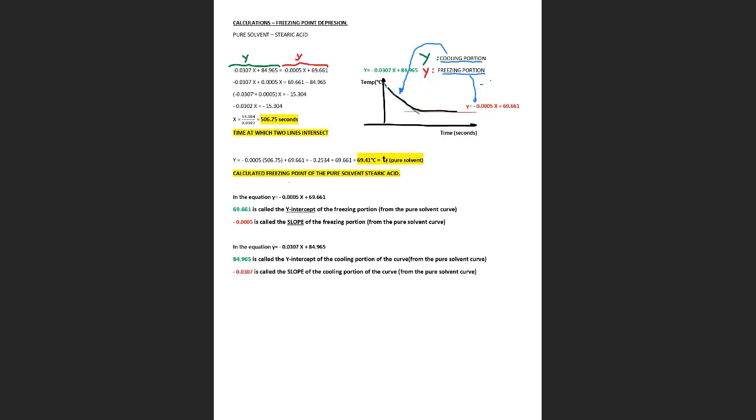And so this is what we have in the Excel. And how are you going to calculate this intersection? Well, this is math, but I just wanted to review so you remember. You know that y equals this equation. At the intersections, both y are the same, right? This is going to be the freezing temperature. This is going to be your freezing point. And the y is the same.